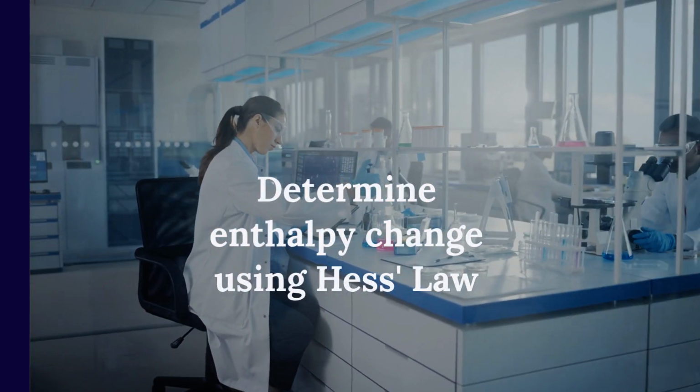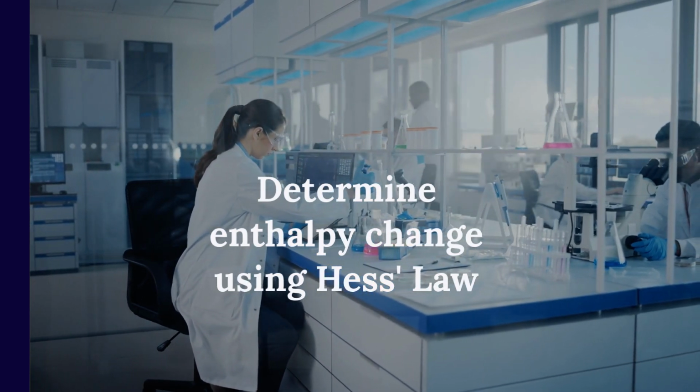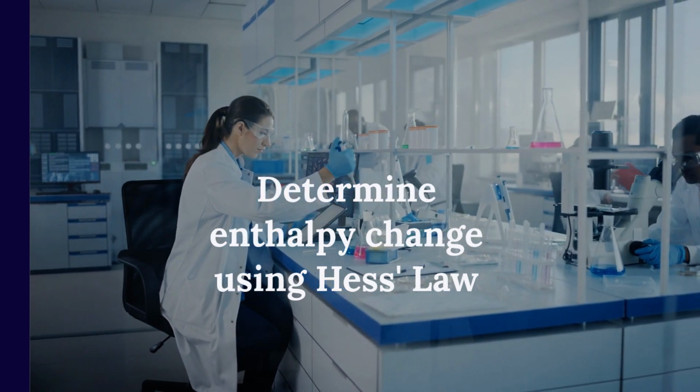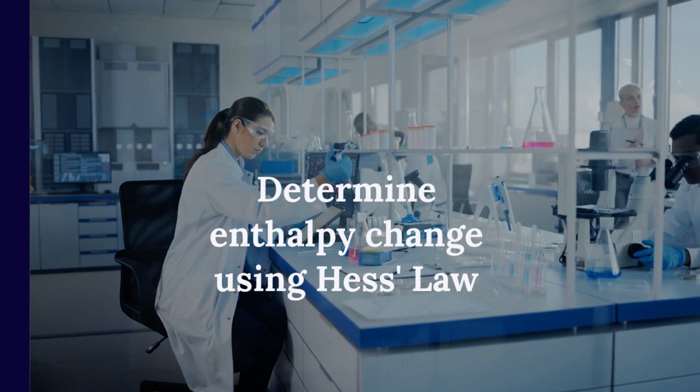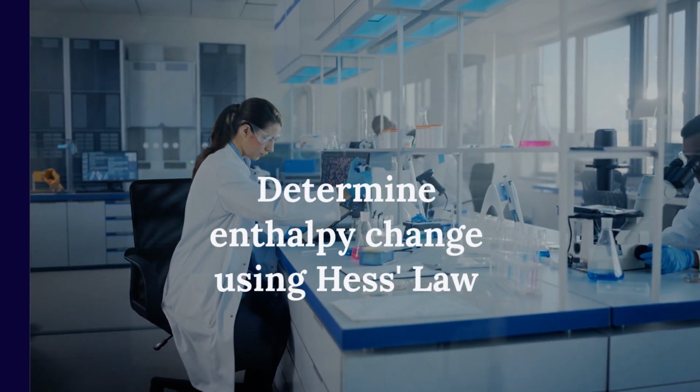Determine an unknown enthalpy change using Hess's law. Compare your experimental values with datasheet values. Use calorimetry and enthalpy cycle calculations. This experiment also addresses key assessment criteria. Dive into the world of enthalpy changes.